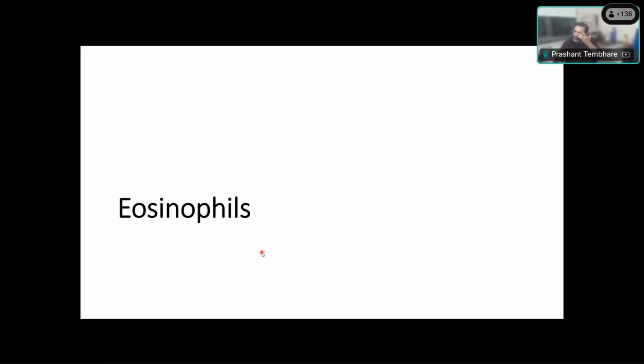Did I answer your question? There is no reply, sir. So the next question is, how do we differentiate blasts and stem cells by CD13, CD33, CD117, HLA-DR and other markers?